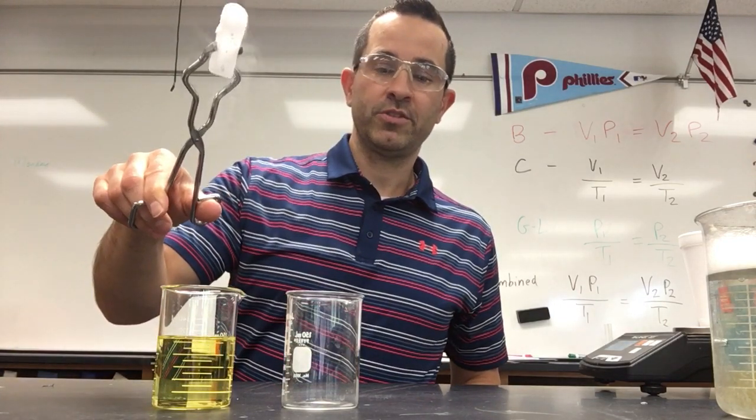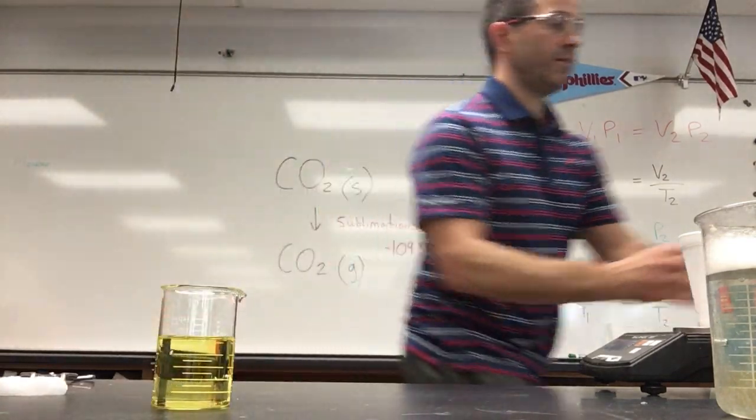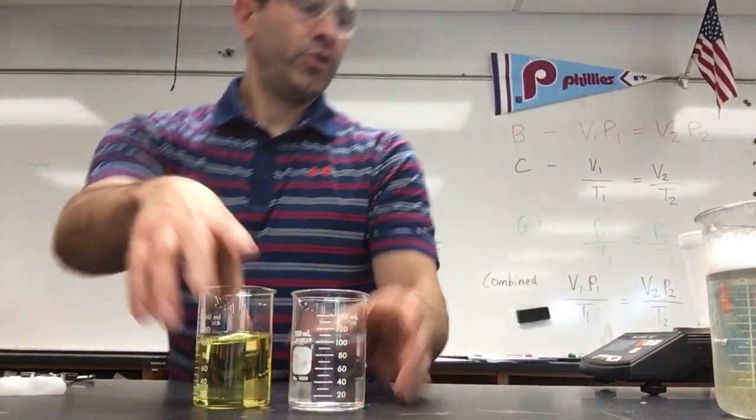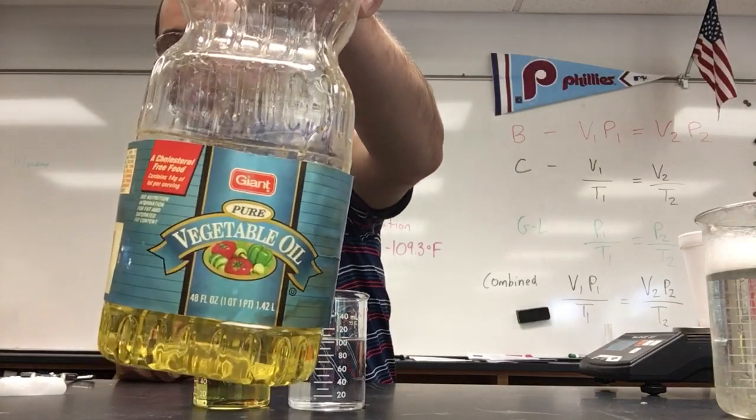So here's a big piece of dry ice, and what I'm going to do is put some water in this beaker. And I have some vegetable oil already in this beaker. I got some old school vegetable oil, seen better days.